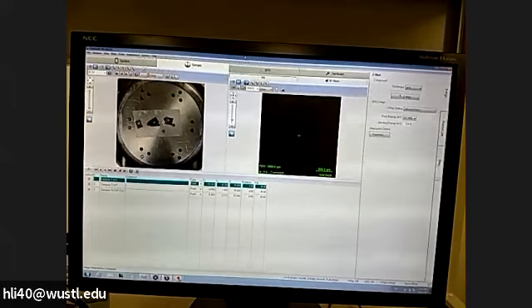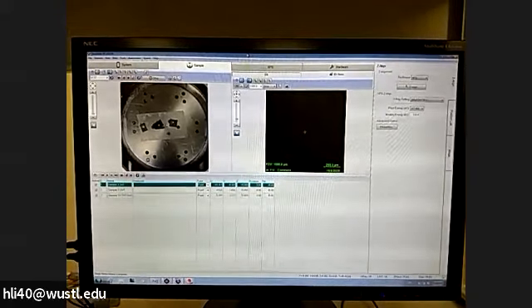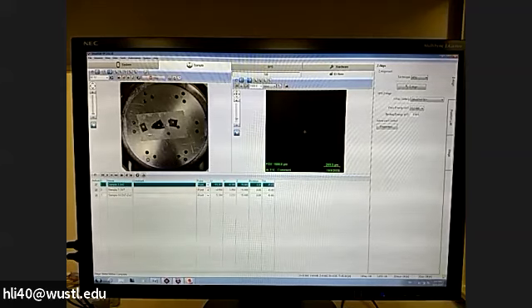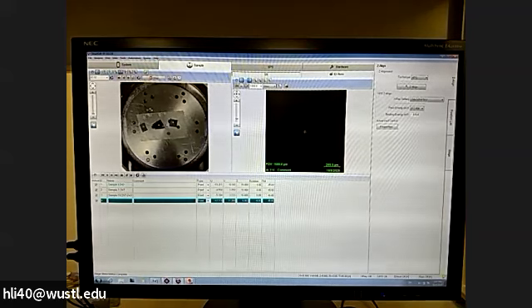All right, so let's assume this is okay. So the next thing, after you place this point, if you haven't placed any analysis point, you can do that again here. Just right click and select create point. It will create a point. You just place the mouse here. You can drag this point away. To do that, you need to click define point. You can drag this point to any place you like to do the analysis. We don't need this one, we just click delete. All right.